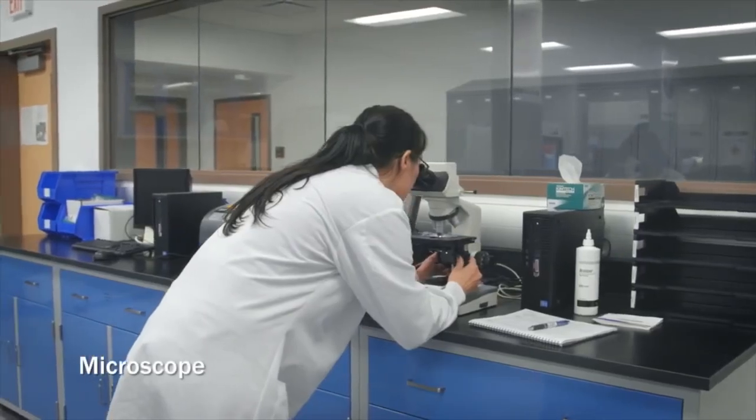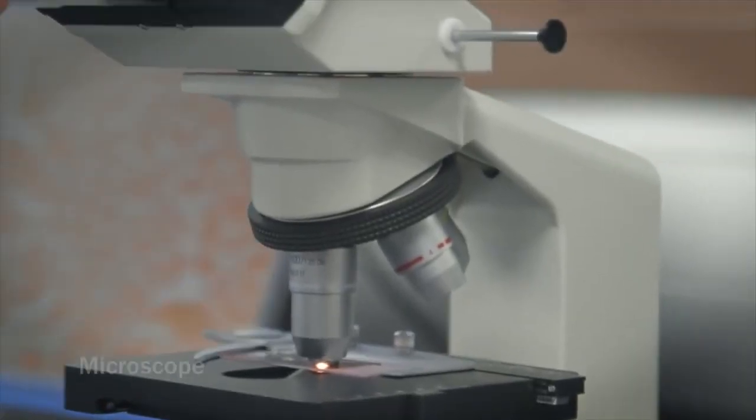We also have a microscope in the microbiology lab, which we use for identifying microorganisms that we may see or grow on some of our petri dishes.